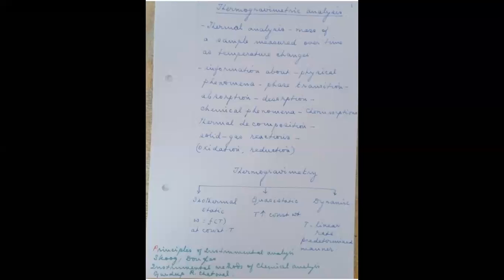So in thermogravimetry, there are three types. Number one, isothermal, which is done at a constant temperature, where the weight is a function of time. And then quasi-static thermogravimetry, and then dynamic thermogravimetry.